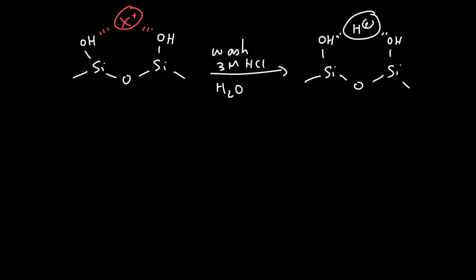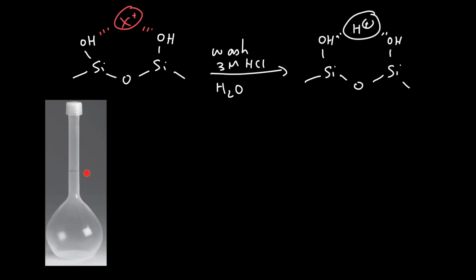If you have brand new glassware, one of the things you might get used to in the lab is soaking it in acid for about an hour, followed by a soak with deionized water. You can use polypropylene glassware as well, so you can get polypropylene volumetric flasks. The nice thing about polypropylene is it doesn't have these OH groups on the surface that can bind very small amounts of metal ions, and so you don't have to worry about trace analysis issues here. The problem is that if it scratches or if you heat it up, the volumes can warp slightly, and so glass is just a little bit more robust to work with.